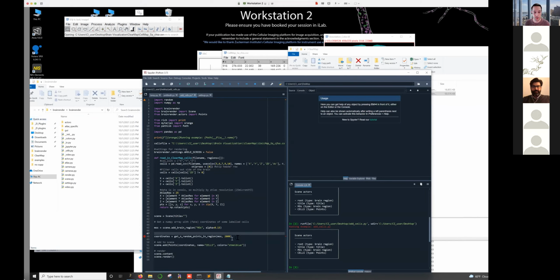So before, what we were doing is we were saying, generate these random points. Now we can just get rid of that, and instead we can say, use our function. And actually, let's just get rid of this regions for now. And we can point to the file. So this is our cells file. So, grab this file and then run this function on it. And in here, just get rid of this regions as well. I'll show you this a little bit later, but right now we just want to process this single file.